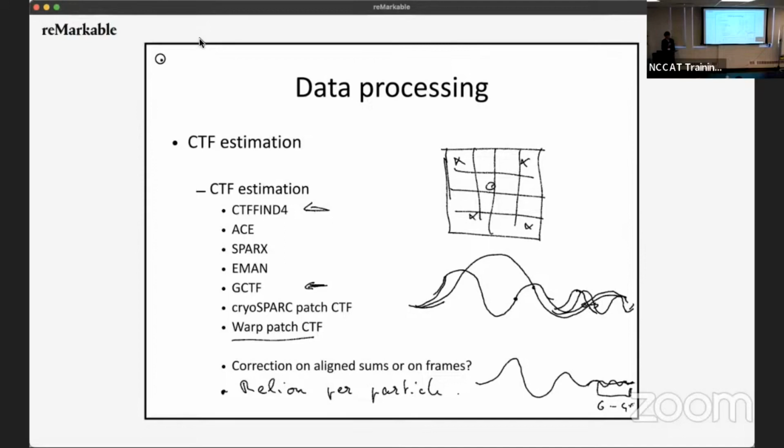Okay, and so now from my experience with very small particles, currently I collect data between, let's say, 0.7 and 1.5 micron. And I've seen others doing even less than that, maybe 0.7 to 1 or 1.2. And that's for very small particles that don't have that much contrast.